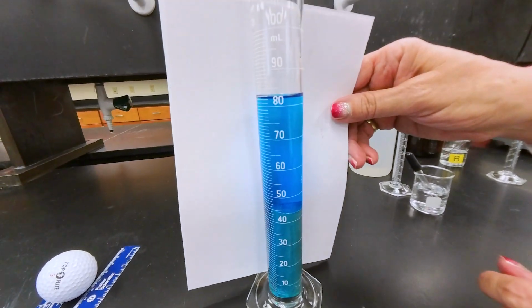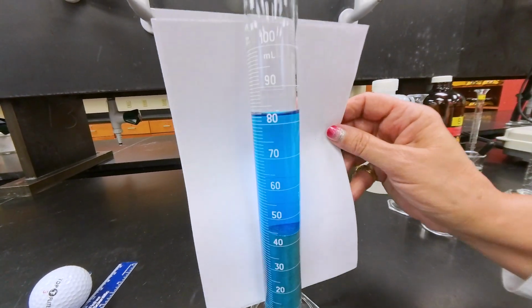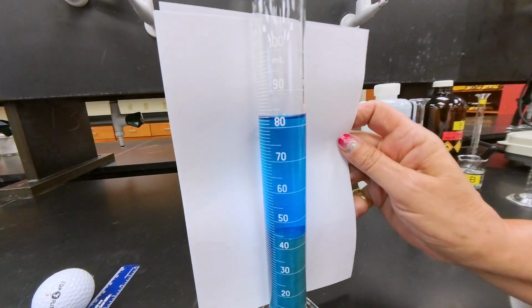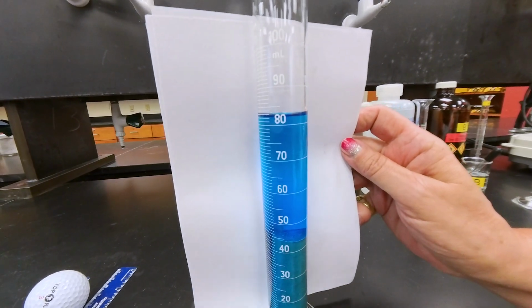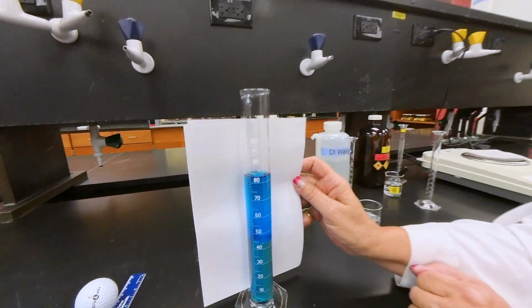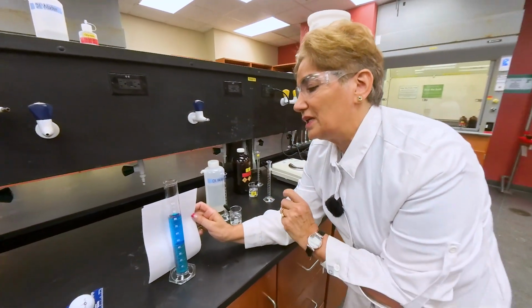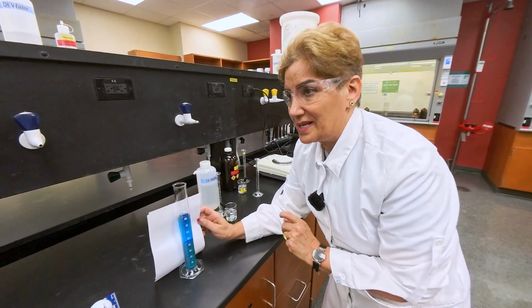Now we have a new volume, which is called the final volume. When we subtract the initial volume from the final volume, we get the difference, and that difference is going to be the volume for the object that I'm using. In this case, the volume is recorded in milliliters, but 1 milliliter equals 1 cubic centimeter.